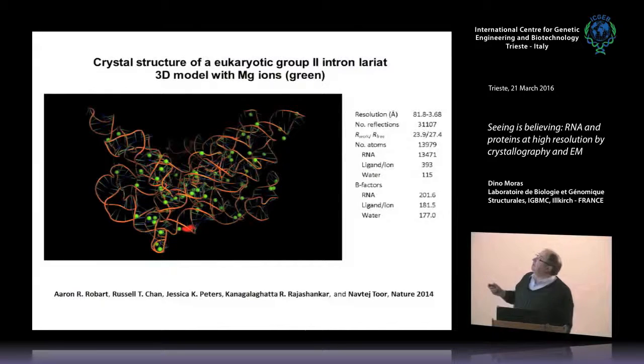That's where I got a bit worried. For the RNA it is 200. For the ligand ion, magnesium, 200. The water, 200. When I was doing my postdoc with Michael Rossmann a long time ago, this number would never have gone that high. I would have been thrown out.